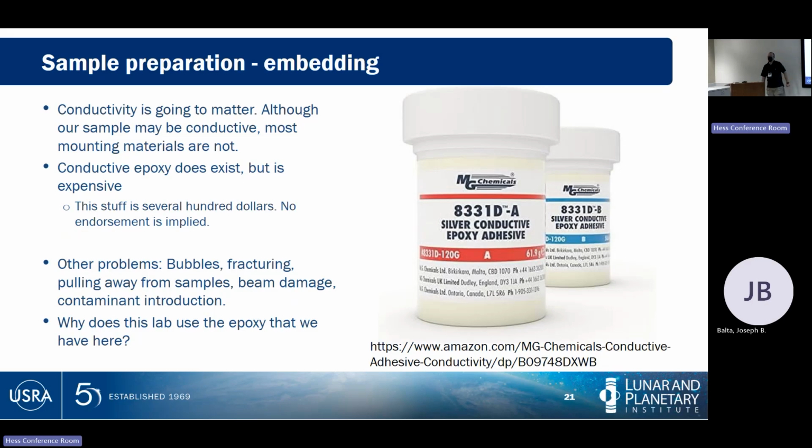Epoxies can undergo beam damage. Epoxies in particular are an organic compound. They will interact with the environment in your SEM. They can degas. If you are trying to measure water contents in a very dry sample or carbon contents in a very dry sample, and your sample has been put in epoxy, you are out of luck, because the epoxy will degas more water and more carbon under a vacuum than the material you want to measure.